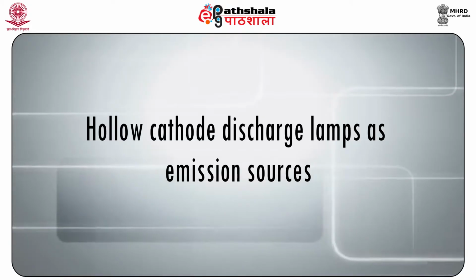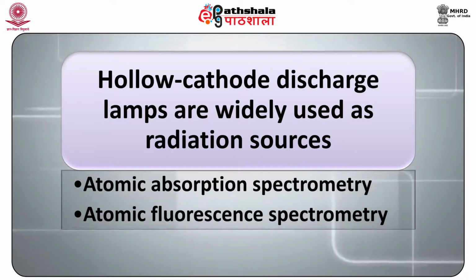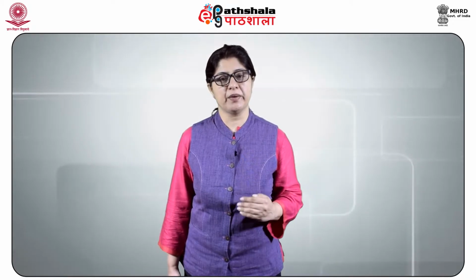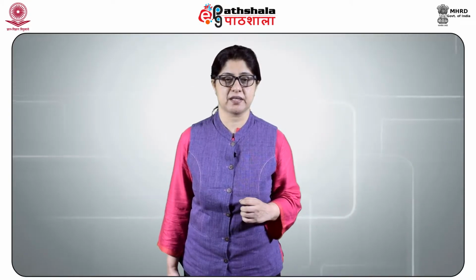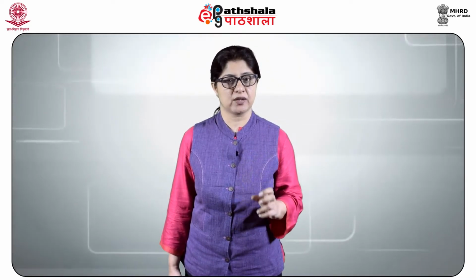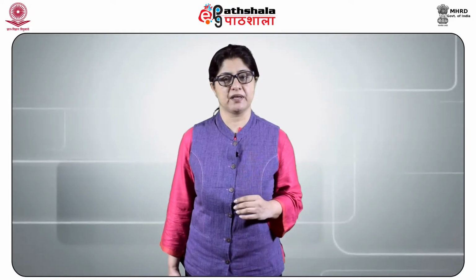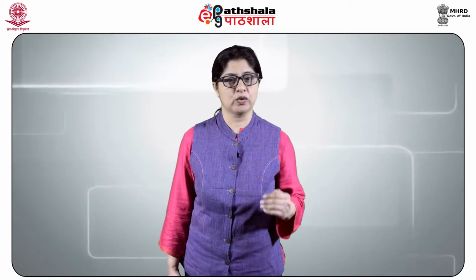Hollow cathode discharge lamps as emission sources. Hollow cathode discharge lamps are widely used as radiation sources for both atomic absorption and atomic fluorescence spectrometry. The use in atomic emission spectroscopy has been limited despite some attractive characteristics. The hollow cathode lamp consists of two coaxial cylinders. The inner graphite cylinder is the cathode and contains the sample material. The discharge material is helium. The radiation is emitted from the negative glow, which is confined to the cathode cavity.